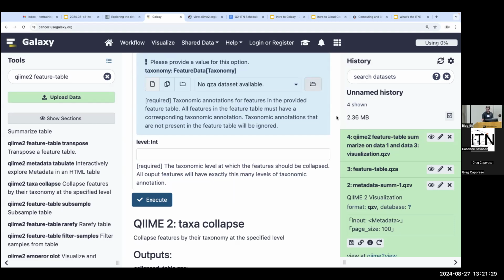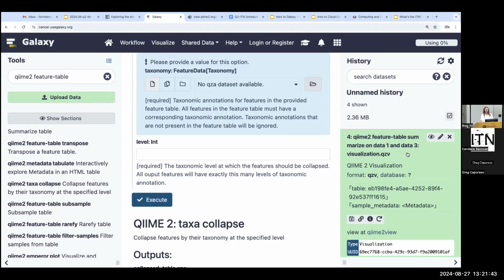Okay, and I think we are green. So I'm going to turn it back to Hannah. All right, I think I saw a few people in the green as well. So let's go ahead and explore our data. If yours is still loading, you can just watch along, and once yours pops up, you can join us.